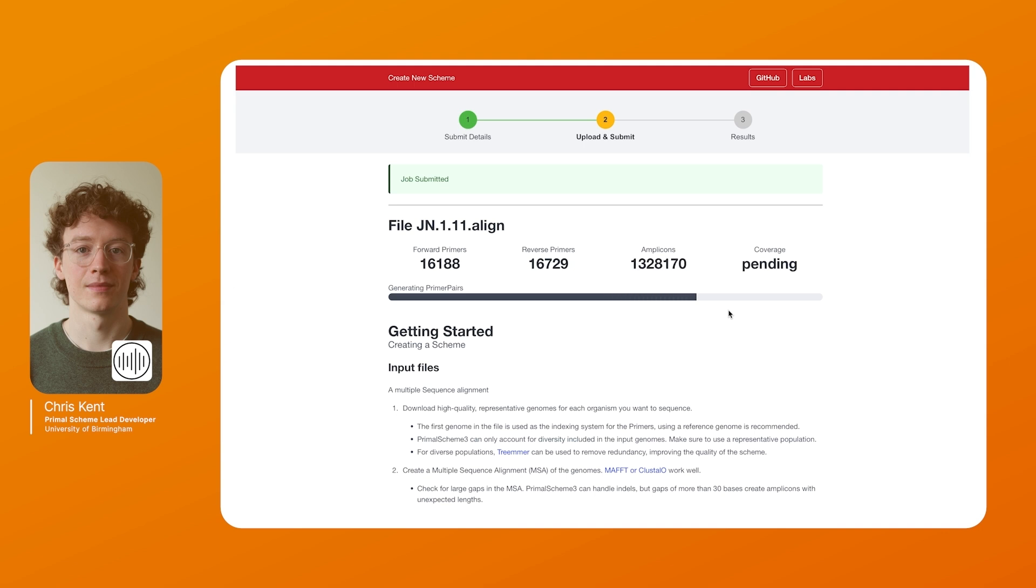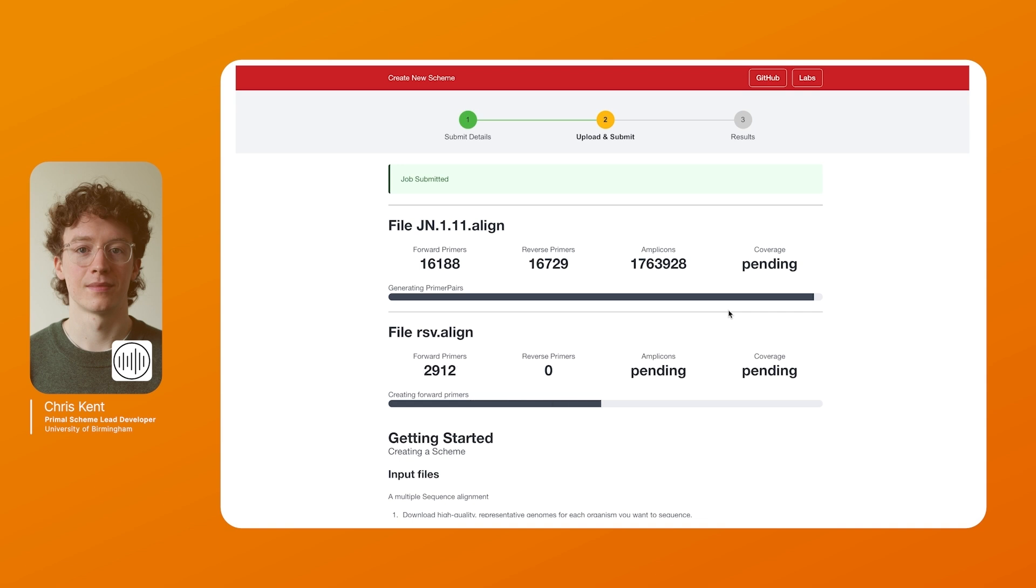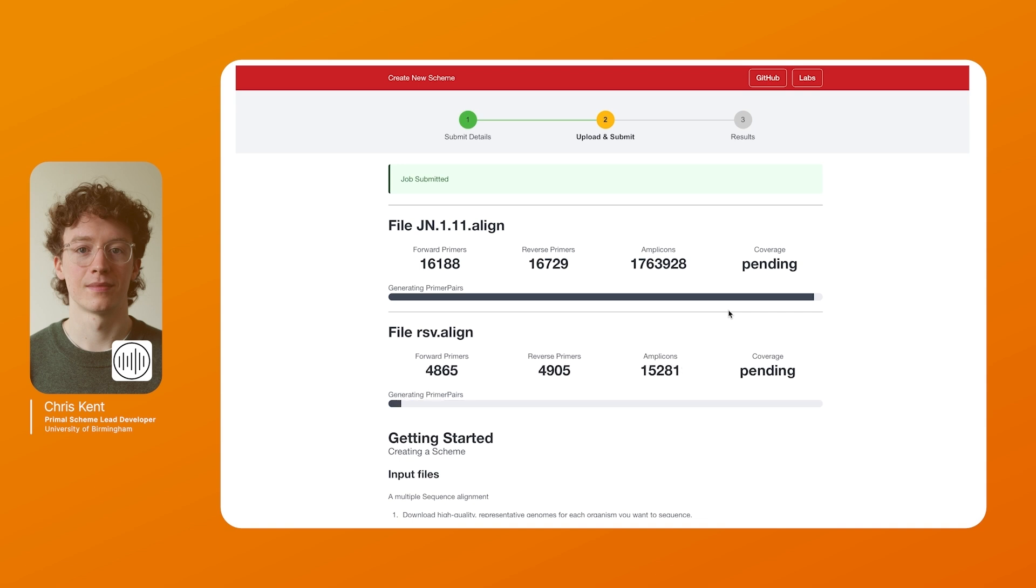As we continue to develop Primal Scheme 3 we'll be adding more modes to the website such as a panel mode which can target specific regions of the genome. On the next step of Primal Scheme 3 it's moved on to the next file and you can see how it's updating the progress as it goes.